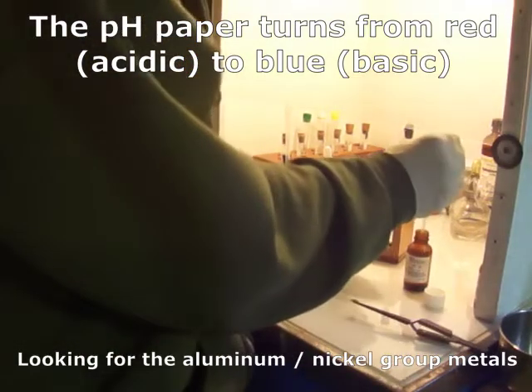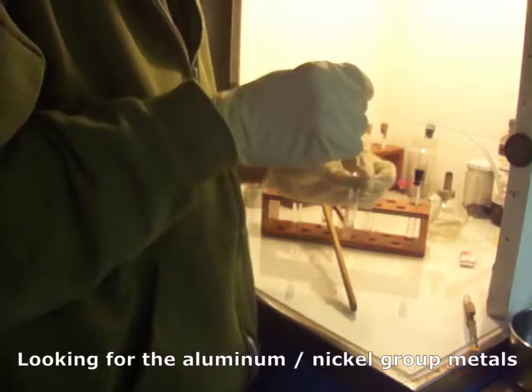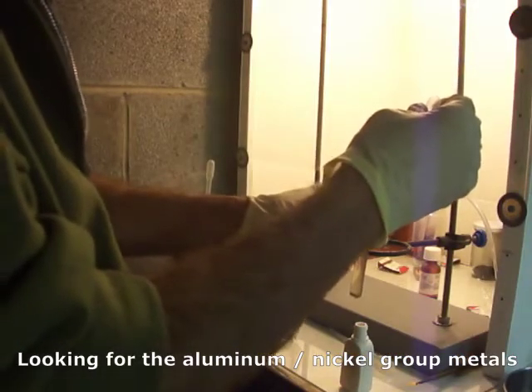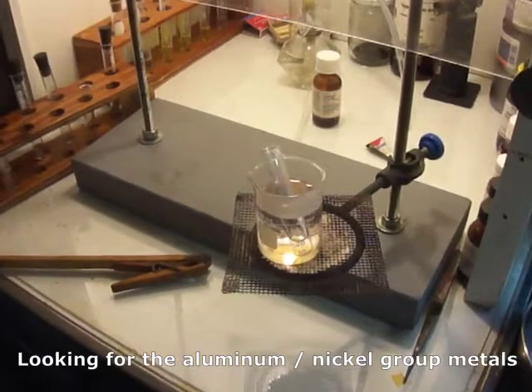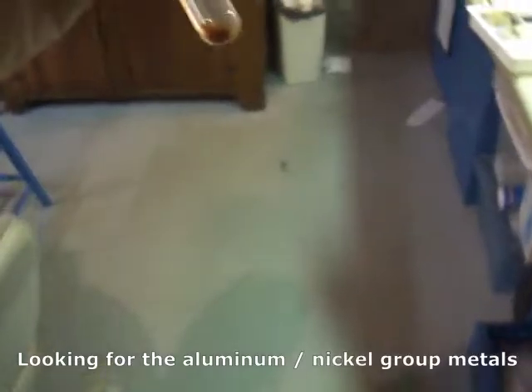And then an extra drop. Now we add 40 drops of hot water. Actually, that's 2 mils. Now we add ammonium sulfide. Now we heat in a hot water bath. And after centrifuging, eureka, we have a precipitate.